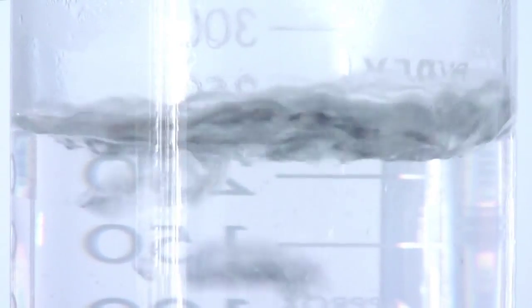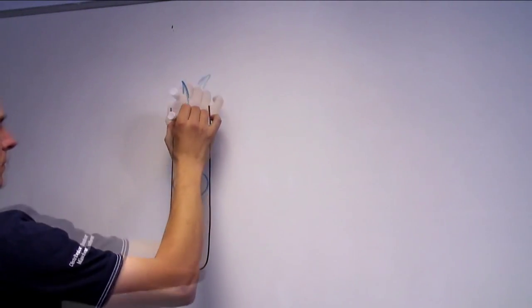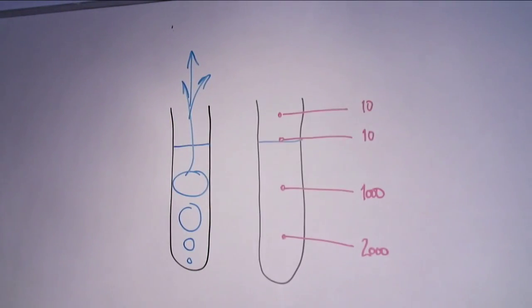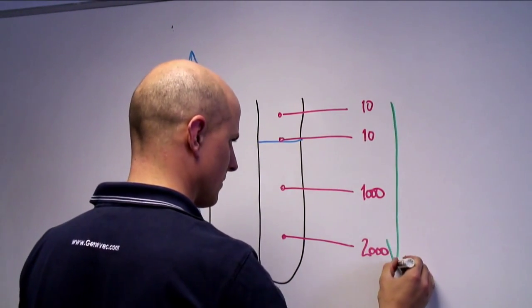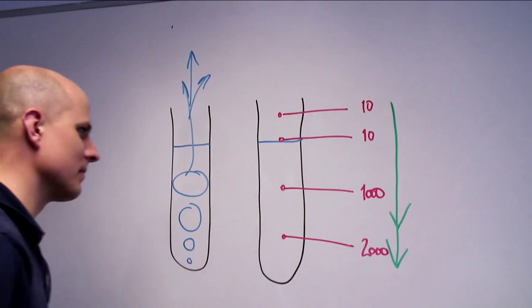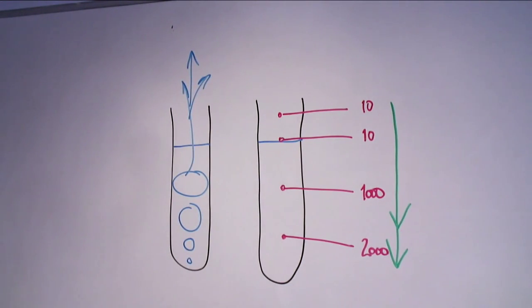The temperature of a boiling liquid cannot increase above its boiling point and is therefore very stable. With just a vacuum, bubbles would still develop in the sample, whatever the set temperature. Bubbles in a tube will force liquid out. To prevent samples boiling over, a centrifuge is used to create a pressure gradient in the tube and ensure that the sample boils at the surface of the liquid.